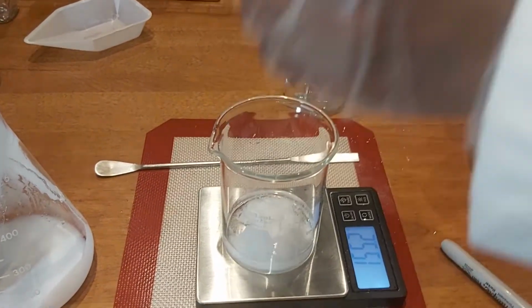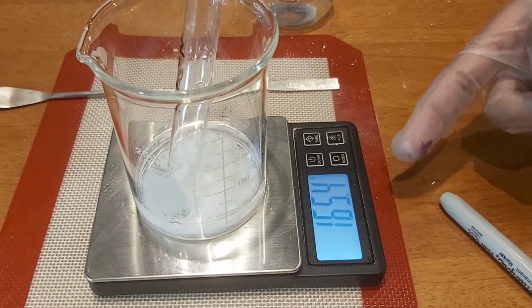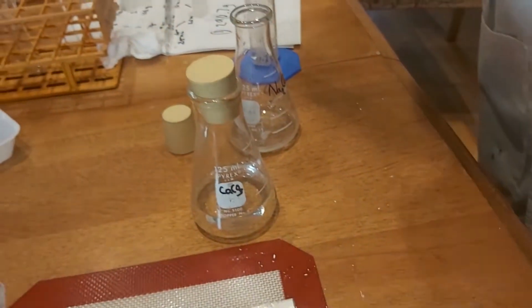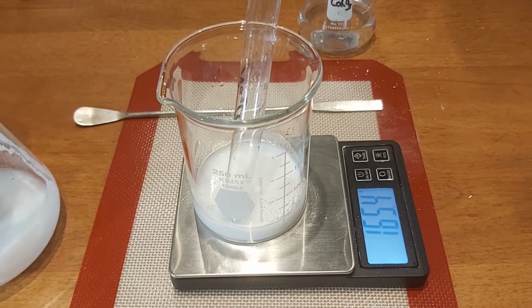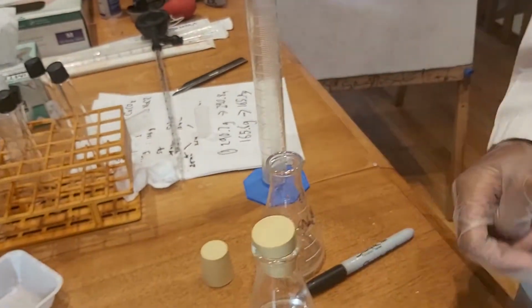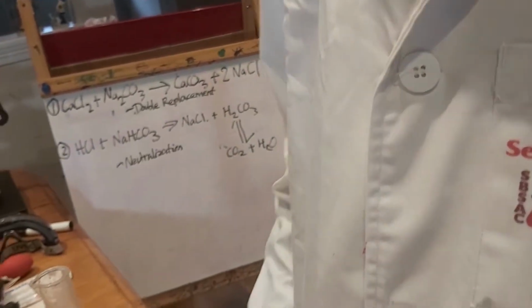Mass changed slightly, 155.2 grams. Actually, no, the mass didn't change that much. Same, very insignificant amount of mass change, 165.4 grams. It seems though even if the system is open, nothing escapes because there's only solids and liquids. They won't escape in a vapor form.